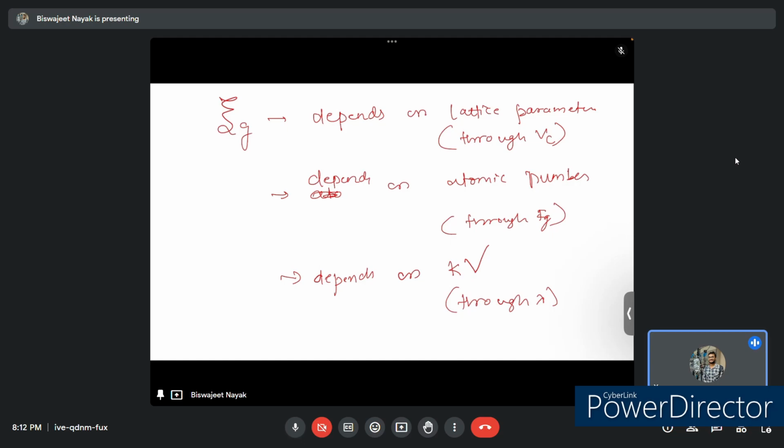The direct and diffracted beams are detected outside the crystal, and we see them on the viewing screen. If we think of the wave function inside the crystal as being a sum of beams passing through the crystal, the direct beam has amplitude psi_0 and the diffracted beams are given by psi_g's. Each beam will have a phase factor.